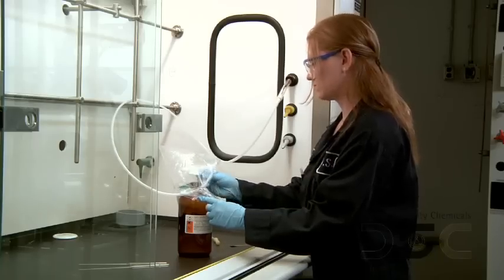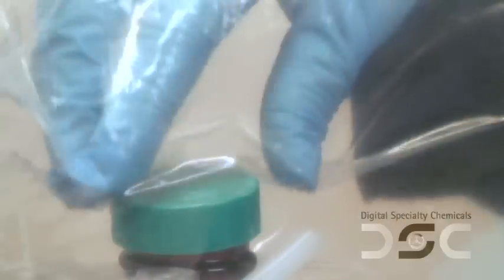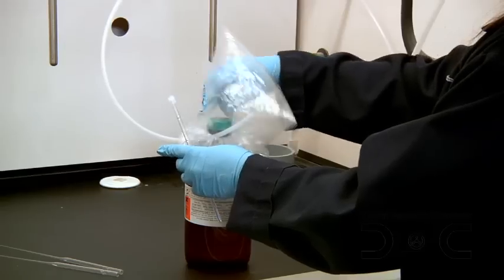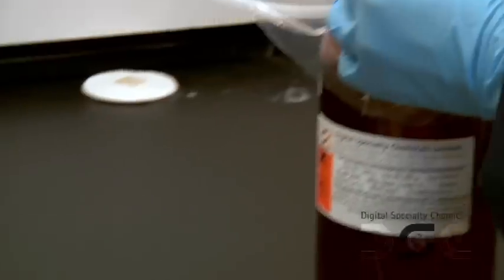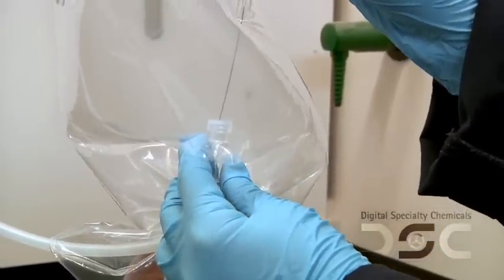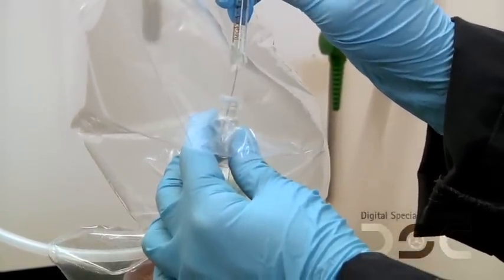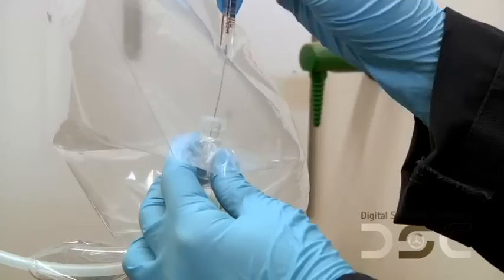Lastly, close the vial or tube and remove it from the bag. You are now ready to analyze the product. Please remember that in the case of HPLC and GC, the syringe needs to be treated in the same way as the pipette and the sample taken from the vial under an inert atmosphere immediately prior to injection into the instrument.